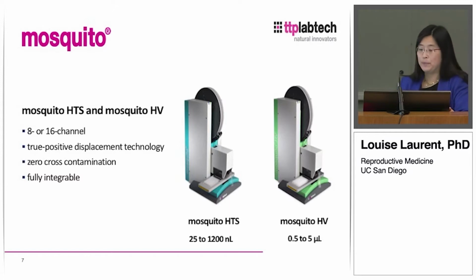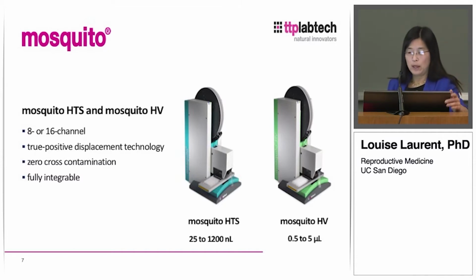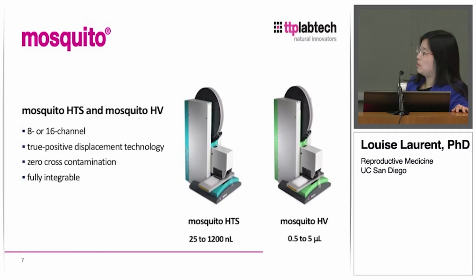For the Nextera library prep, these are the systems that we used. So Sohaila can give you a lot more details, and I think there's an HV over at the booth that you can take a look at if you'd like. My lab is also open for people to take a look at if they're interested in seeing these things in action.